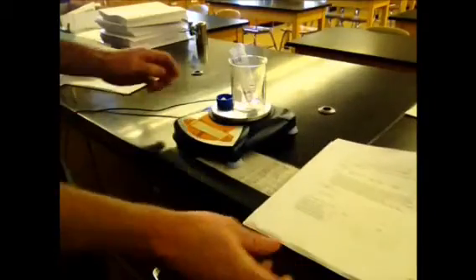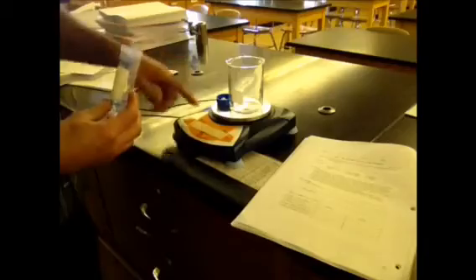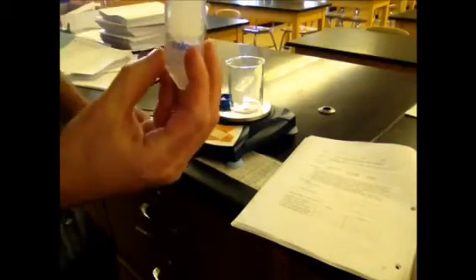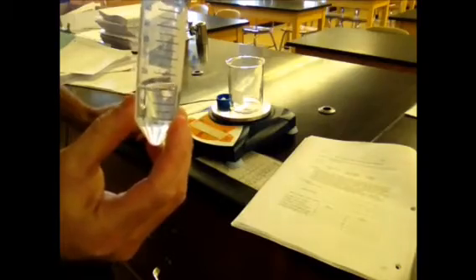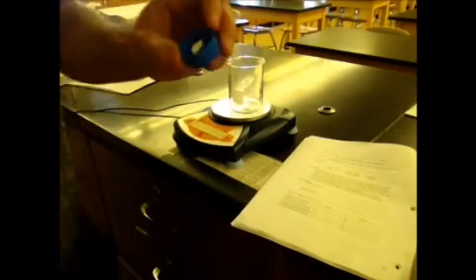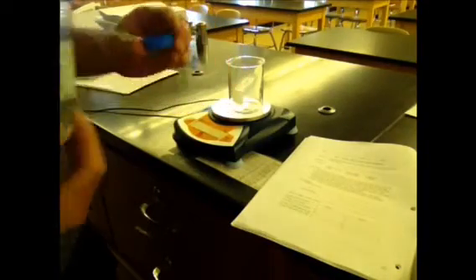This is the video for the mass of a gas lab. Now everything you need is pretty much what's shown here. You need your packet, a beaker, the electronic balance, and a vial. It's filled up about a third of the way, so around 15 milliliters of water would be fine. You need the cap with a little piece of Alka-Seltzer taped to the top.